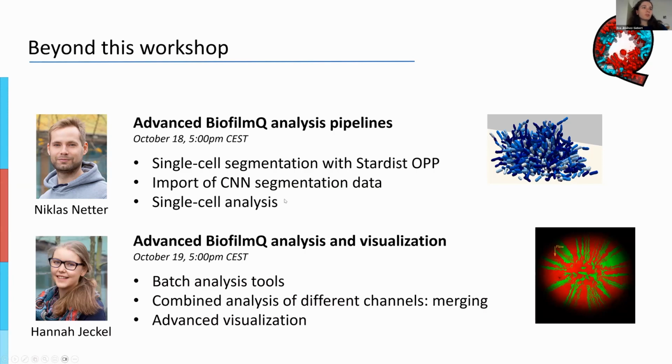And the third workshop in the series is going to be by Jeckel, and it's going to be about advanced BiofilmQ analysis and visualization. And it's going to be on Thursday, also 5 p.m. Central European Summer Time. And she's going to talk about the more advanced features of BiofilmQ, like batch analysis tools. For example, if you have a lot of folders on which you want to perform the same task over and over again, you can use the batch analysis tools and have only to click once instead of clicking through every folder.